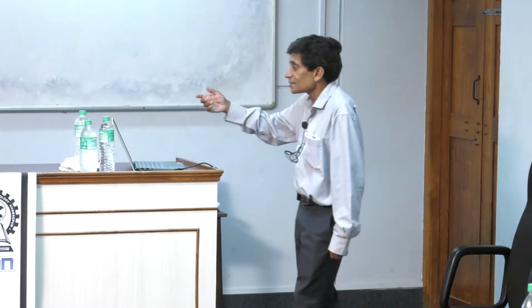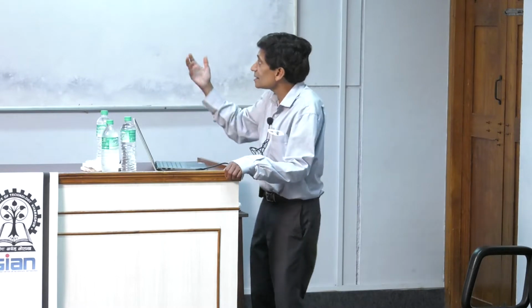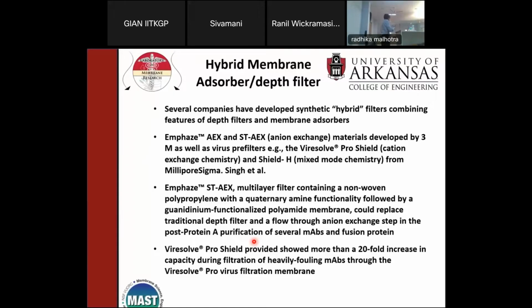So in fact, membrane adsorbers could be using multimodal ligands, right? But the aim is different. Here you're trying to do a polishing step. So you're removing host cell protein, DNA, virus particles. There's no cell debris. But again, you can see that many of the same features are interlinked here.